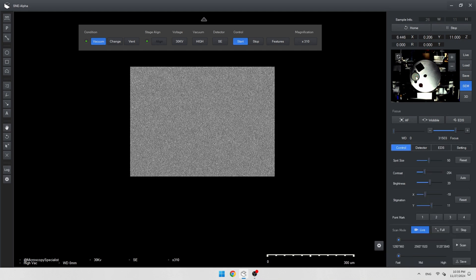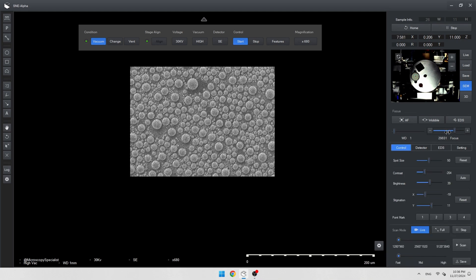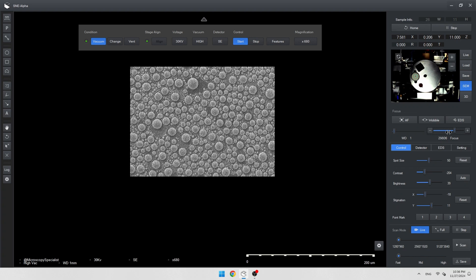Okay, something is visible here and now it's time to make some adjustments. Let's look at all the parameters step by step.